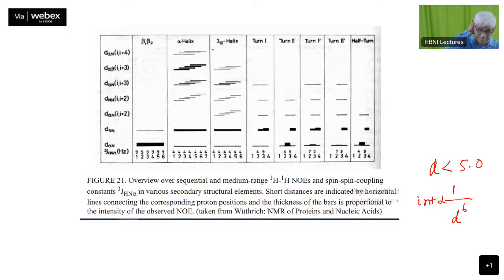And the helix turn, helix kind of a motif. And this is for the betas, parallel betas and anti-parallel betas, both are present there. Beta anti-parallel and beta parallel. Let us start from the betas. In the beta, what are the strong peaks you will see? Here is the residue. These are the coupling constants here. Beta below, what is indicated here? This is the coupling constant. We will not talk about that right now. We'll see it later. Okay, next one, next step.